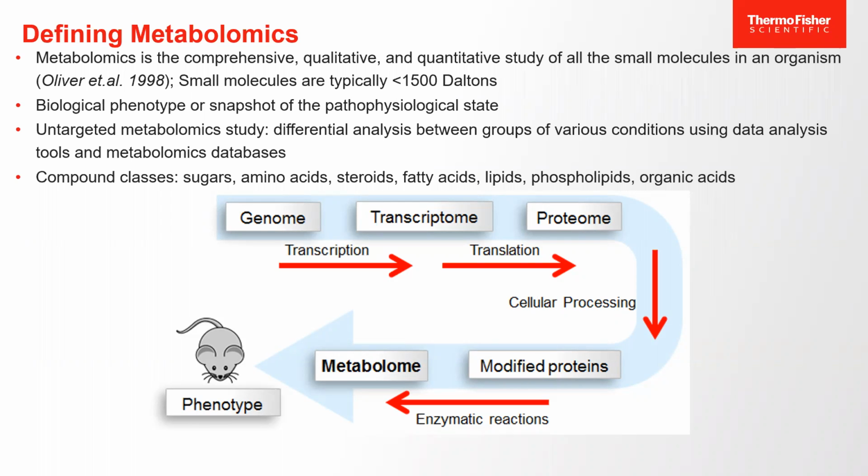And then you go from the metabolome into the more specific metabolites. The metabolites' concentrations, unlike other omics measures, directly reflect the underlying biochemical activities in the state of the cells or the tissues. Metabolomics is the endpoint of the omics cascade and provides unique insight into biology from a phenotype perspective. So it gets super specific in terms of what it actually is.